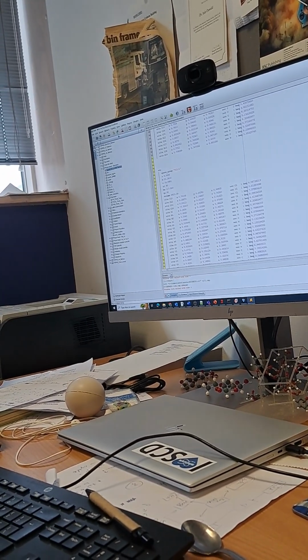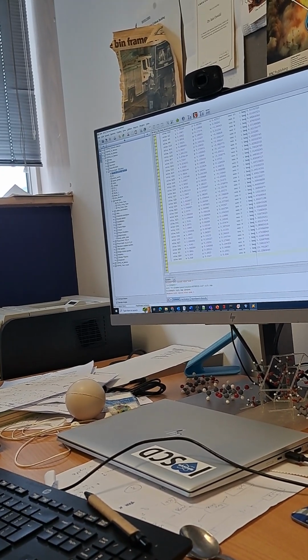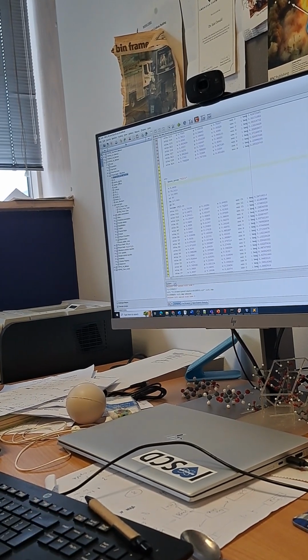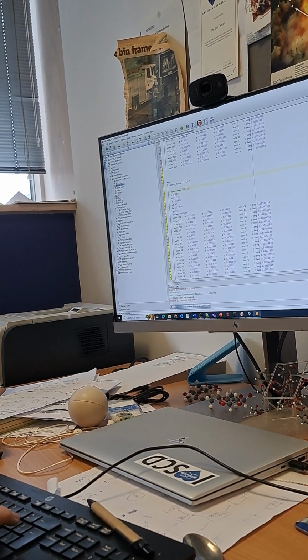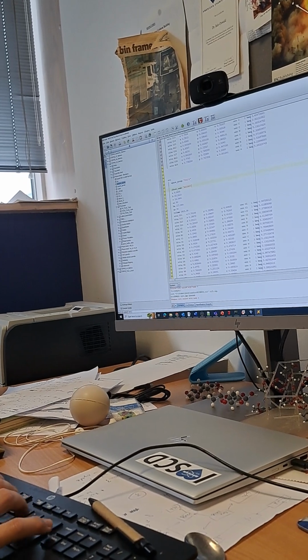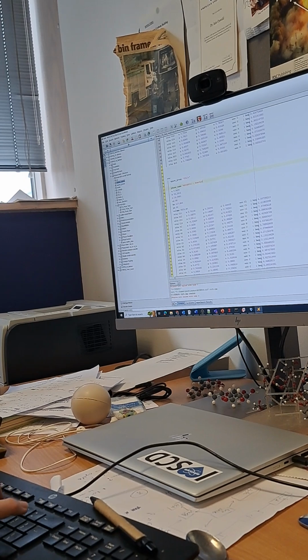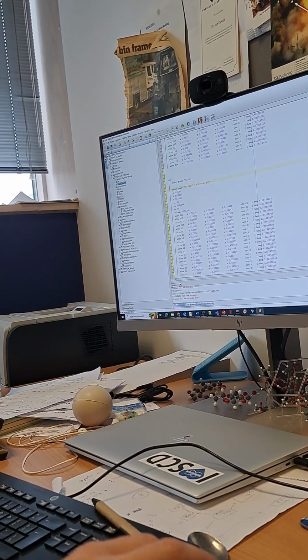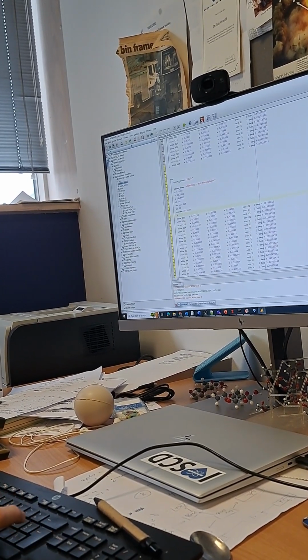Now from here, what do we need to add? Structure we've got. Phase name. Scale, I'll come to that too. So we can double click on phase name this time round and do it this way. This is miconazole, MiCONZ02, hemihydrate, and close brackets. What did you say you needed, a scale function?